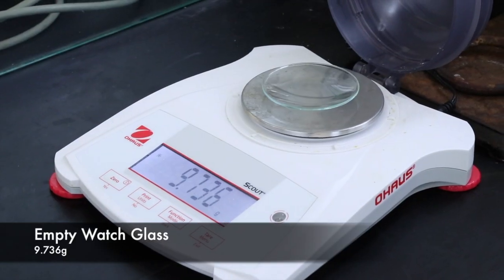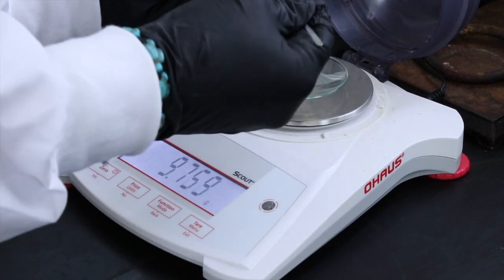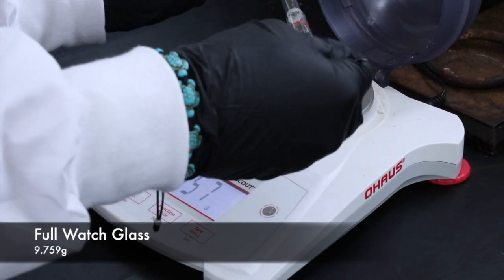First, I'll want to weigh out the alcohol product on a watch glass so that we can calculate a percent yield for this experiment.